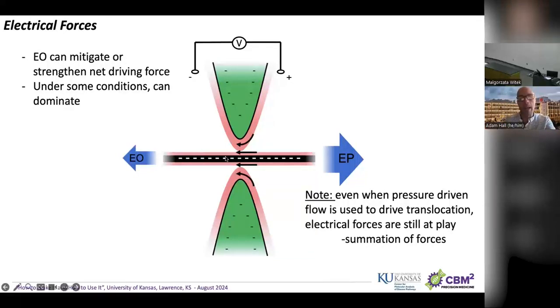And so if you have a negatively charged molecule, it's actually going to be covered by positive charges that are essentially countering, screening that charge. Typically, the pore itself, which you can see here, is also going to be negatively charged, so it's covered by positive counter charges as well. The electrodes are still supplying that electric field, while the molecule, which is negatively charged, experiences electrophoresis towards the positive electrode.